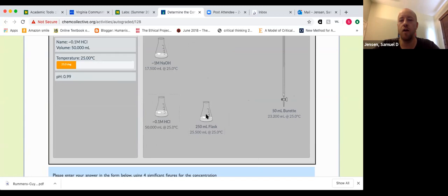We connect our burette to our acid sample, titrate again. Again, you can duplicate your acid sample a few times and conceivably your values would be relatively close to one another. You can then average and calculate the molarity of the HCl. That is the purpose of this experiment. I want to know what is the concentration of the HCl sample.